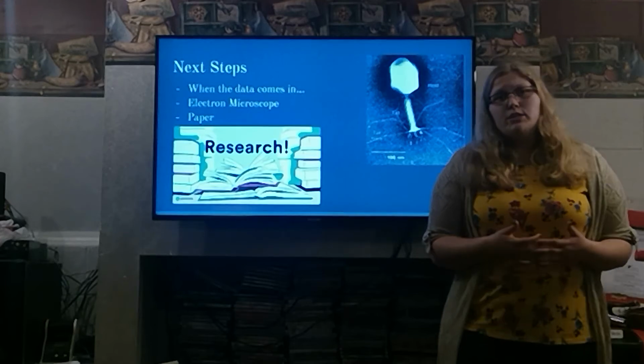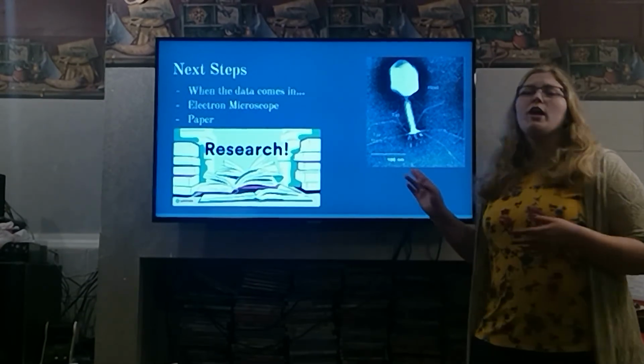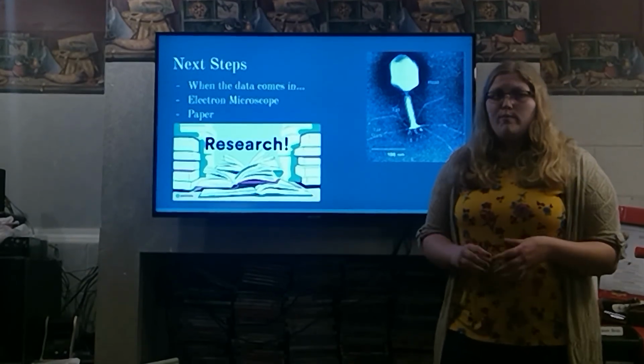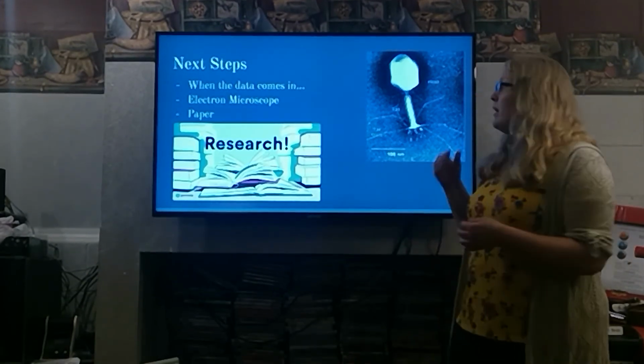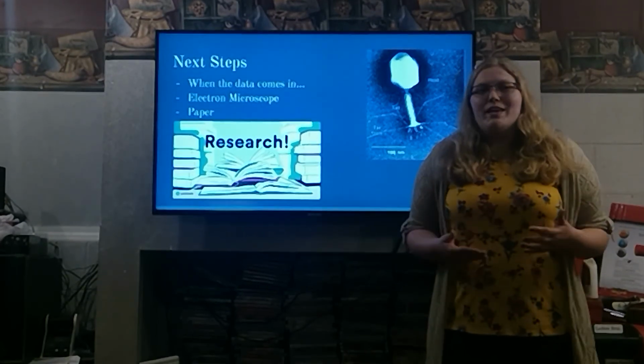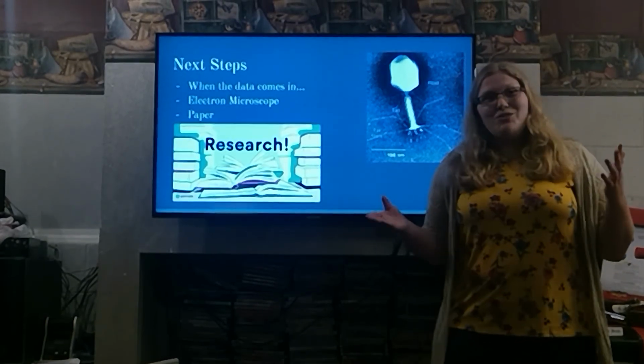We also would really like to use Argon's electron microscope to get a picture of our phage. This is just a picture I got off the internet, but we want to get a picture of our phage to know what we've been working with for the past several years. And then after that, we want to compile all of it into a research paper and hopefully get it published in a waterway journal. Thank you for listening to this presentation.